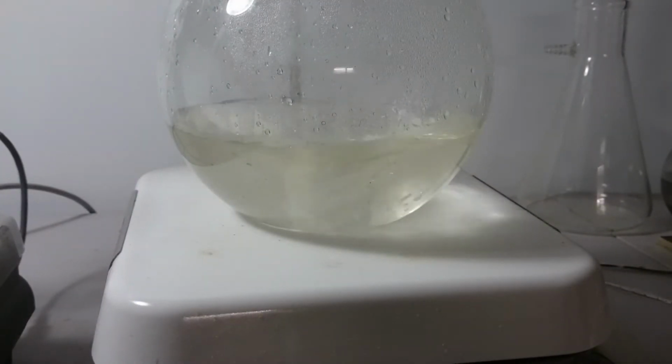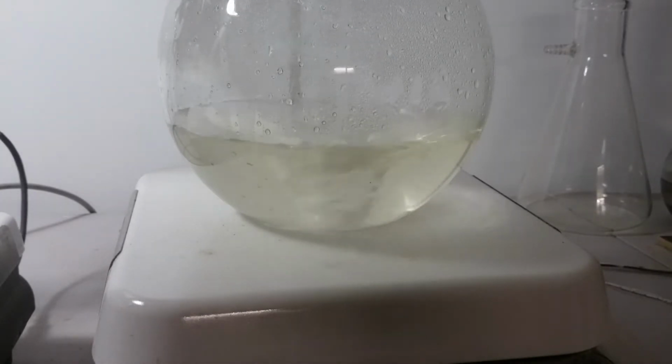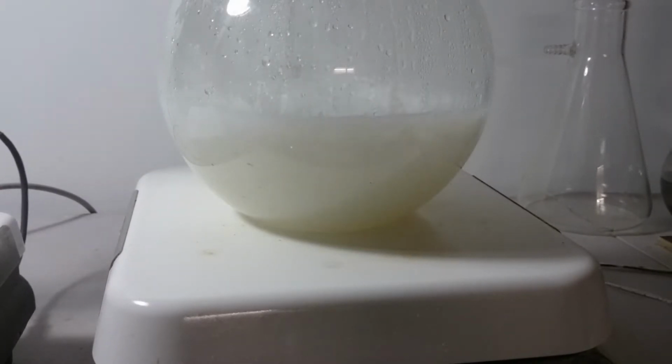In this step, I add the calcium propionate to the sodium carbonate solution. I do so quickly under strong stirring, and you can see an immediate white precipitate of calcium carbonate. This is our double displacement reaction.